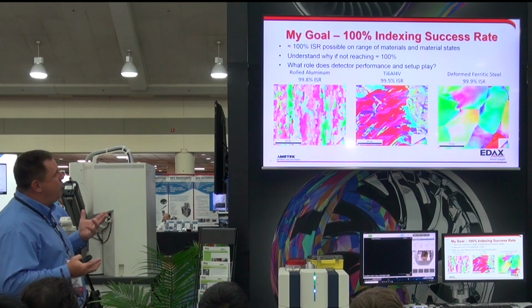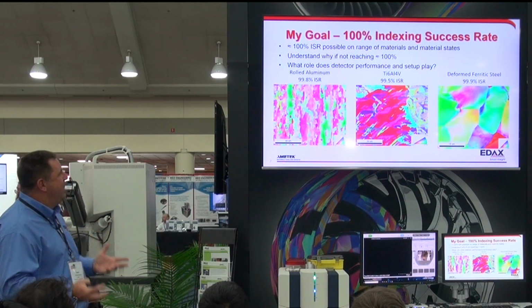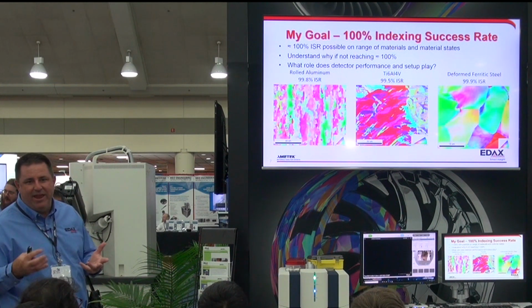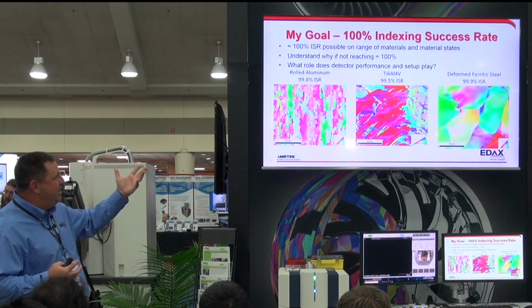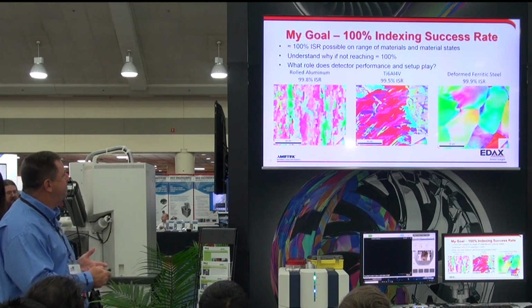So there's two questions of when we don't reach 100%: trying to understand why, and, more for the role of this talk, what role does detector performance and setup play in affecting indexing performance? Because as we develop technology, we want to meet or exceed current performance benchmarks.